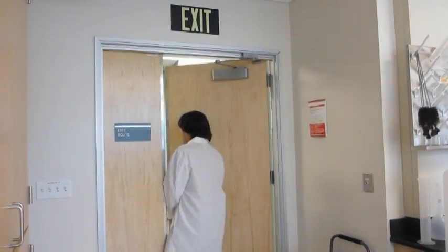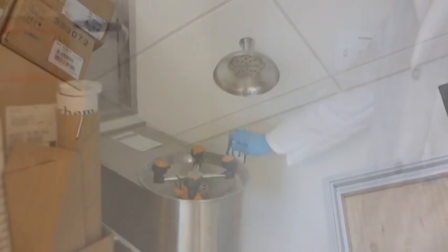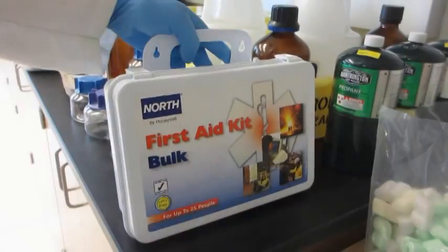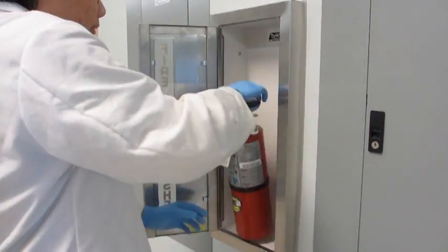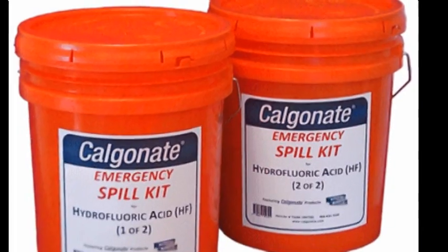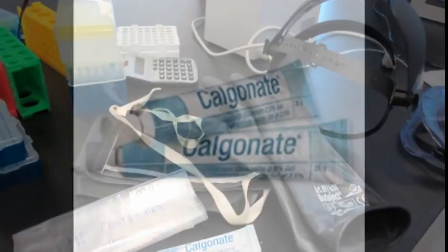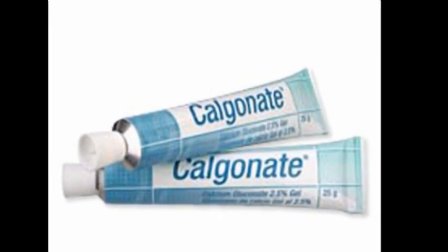Orient yourself to the laboratory by locating and knowing how to use the nearest emergency equipment ahead of time, such as the emergency exit, the safety shower, eyewash station, first aid kit, fire extinguisher, and fire alarm pull station in case you need to evacuate the building. Have a chemical spill kit nearby that contains sodium bicarbonate for neutralization and calcium gluconate gel, which you'll need in case of accidental skin exposure.